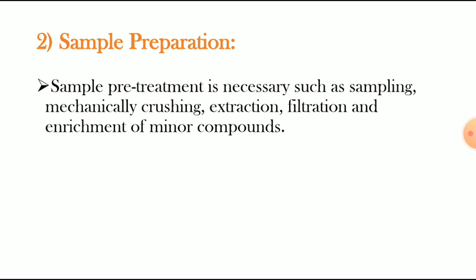any other kind. Then if that sample may be present along with some other material, we have to extract it from that material into a separate form, then filter it, and then that compound, or you can say sample, we can use for the separation purpose.